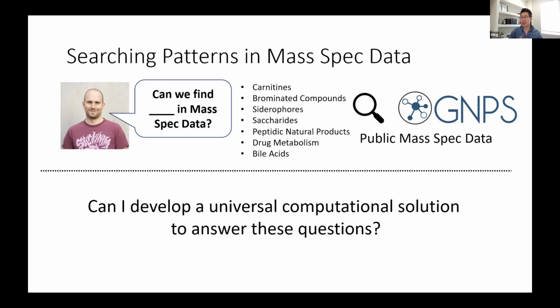And one thing that we know innately is that whenever we measure a molecule on the mass spectrometer, it creates some sort of signature. It has to. It creates some data that's reproducible and, to some extent, unique. So there are peaks in the MS1 spectrum, fragmentation in the MS2 spectrum, and maybe something collected in MS3. There's also retention time information and ion mobility information. Depending on the composition, it can change all of these different things. And we know intrinsically, as chemists, what those patterns are.